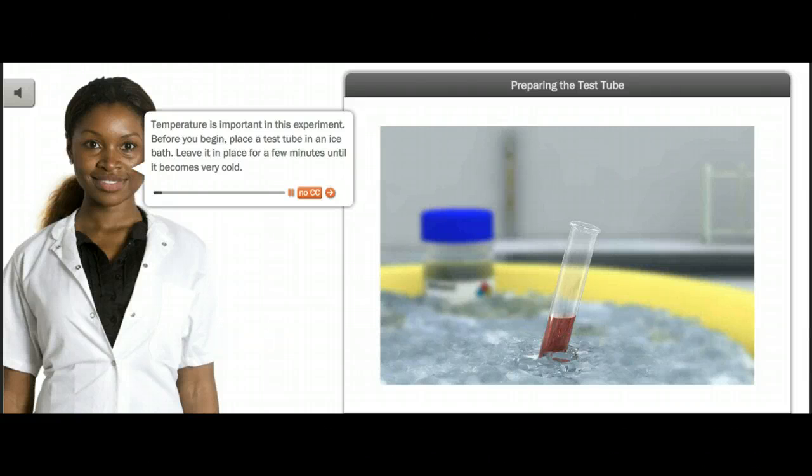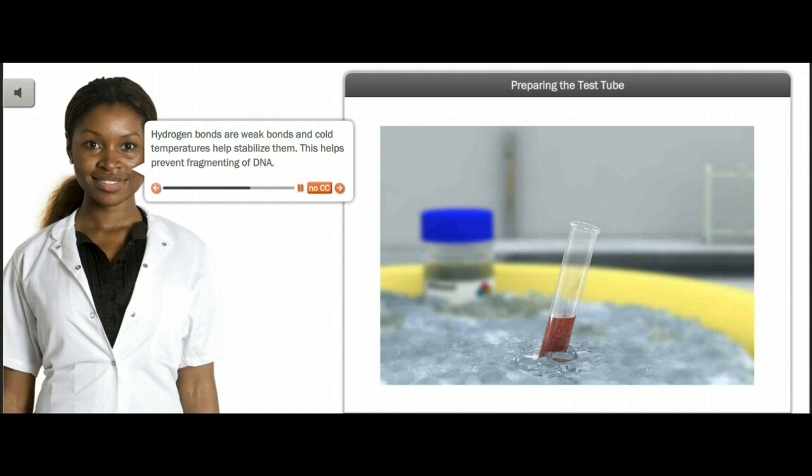Temperature is important in this experiment. Before you begin, place a test tube in an ice bath. Leave it in place for a few minutes until it becomes very cold. Recall that a DNA molecule is composed of two strands of nucleotides that are held together by hydrogen bonds between nitrogenous bases. Hydrogen bonds are weak bonds and cold temperatures help stabilize them, which helps prevent fragmenting of DNA. The filtrate is added to the test tube while it is in the ice bath in order to maintain low temperature.